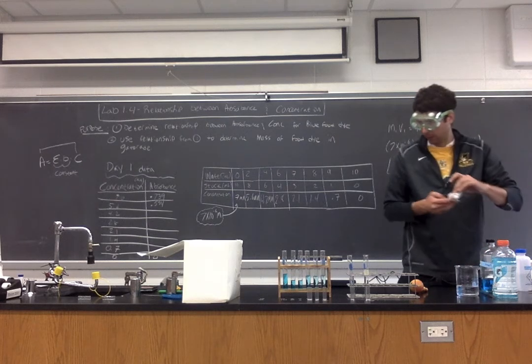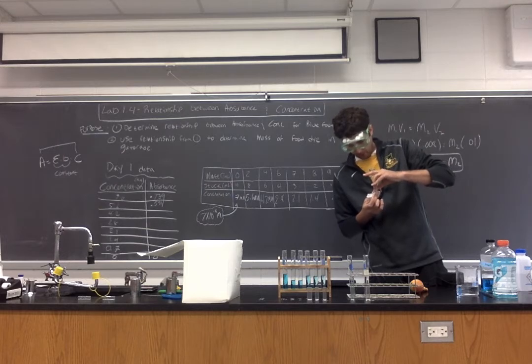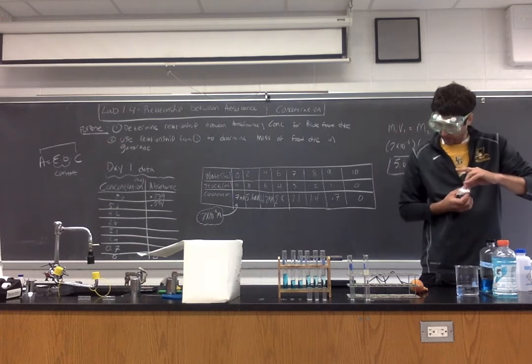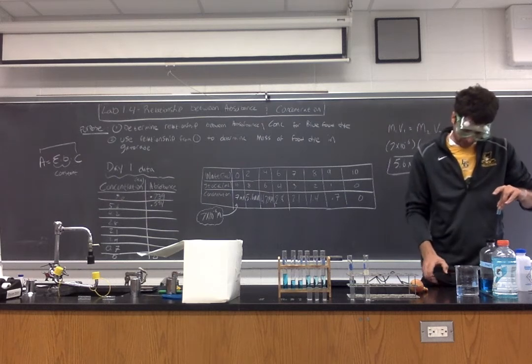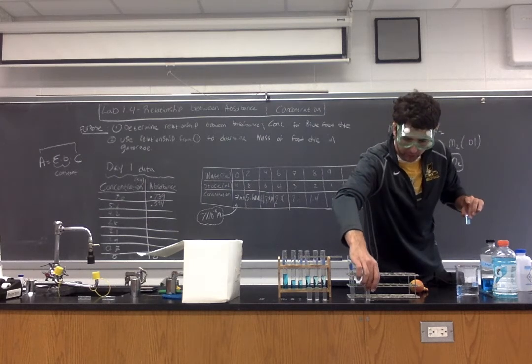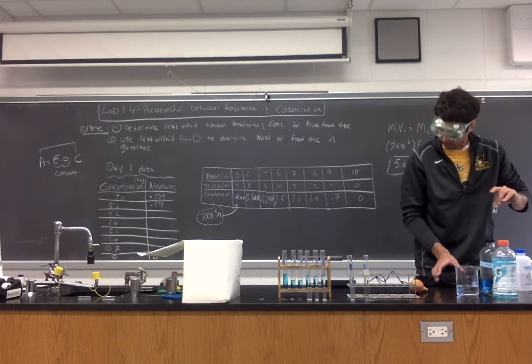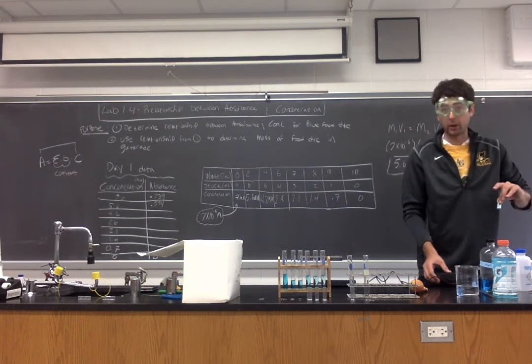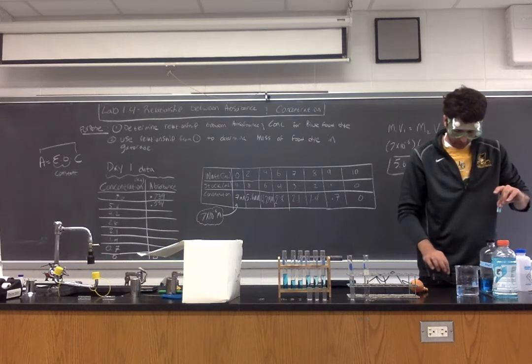So at this point, ladies and gentlemen, we have something that will happen from time to time during this process. We're not reading 0, 0 for deionized water, or air is not reading 0, 0. Let me double check to make sure deionized water is reading 0, 0. Okay. So the deionized water is still reading 0 on our absorbance, so we do not need to recalibrate.